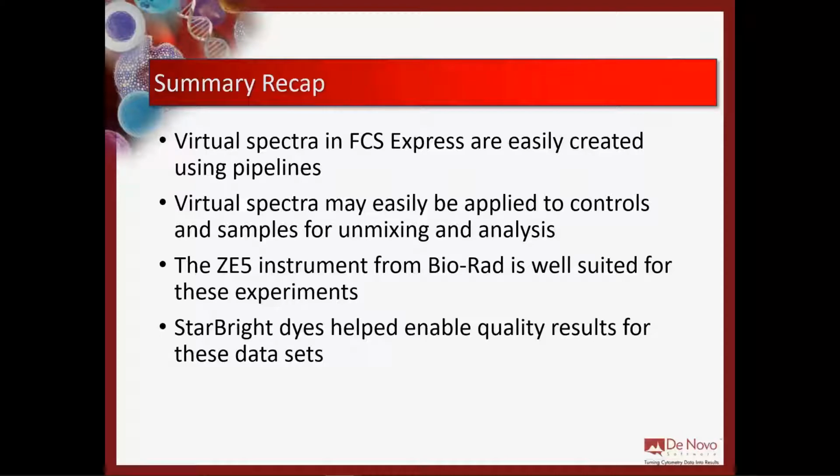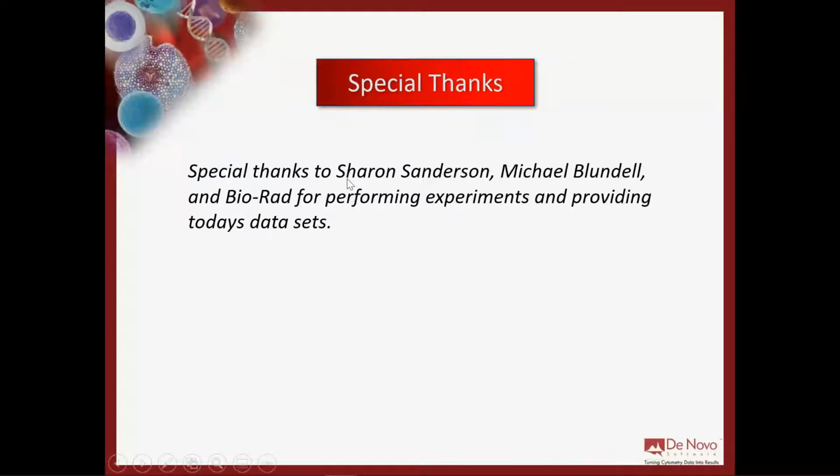And again, what we've found so far is that the ZE5 instrument from Bio-Rad is very well suited for these experiments, right? Obviously there's probably going to have to be some optimizations and things like that. It's not a spectral instrument, right? It is a classical cytometer that we are using as a spectral instrument because of the software technology that we have. But importantly, the Starbright dyes used today helped enable some of the more quality results for these data sets, and we're indebted to Bio-Rad for that.